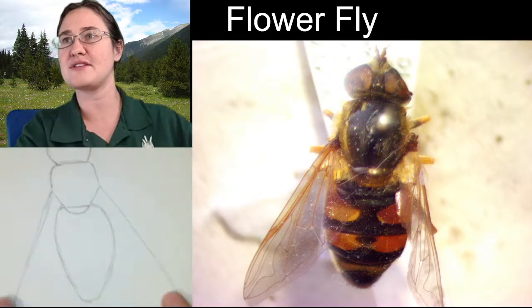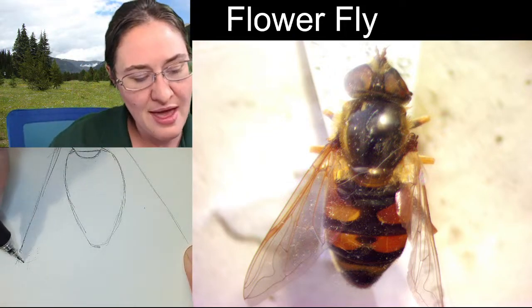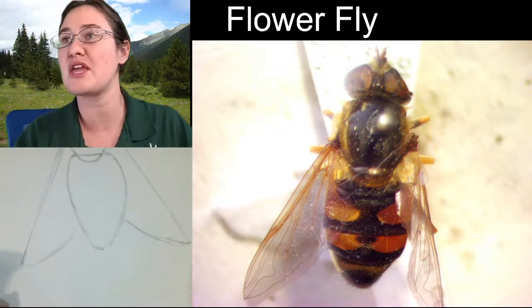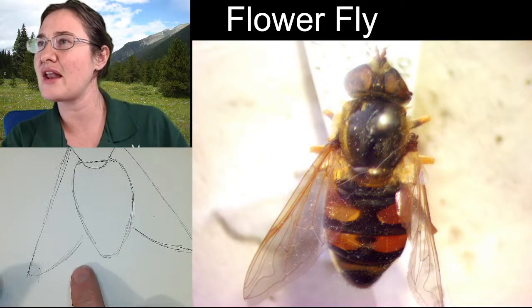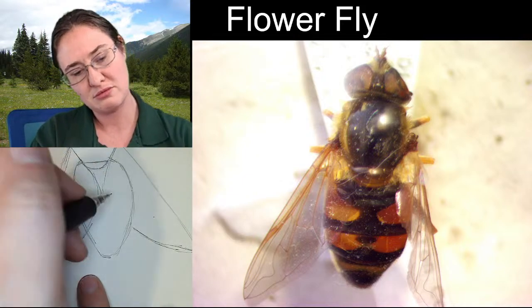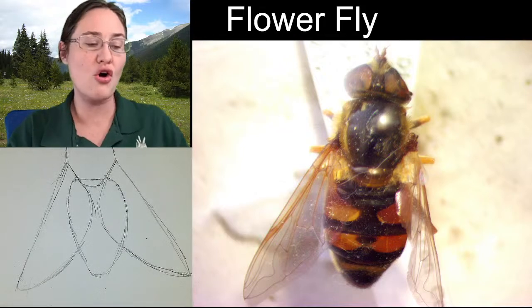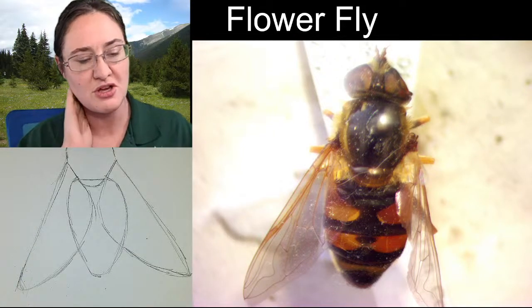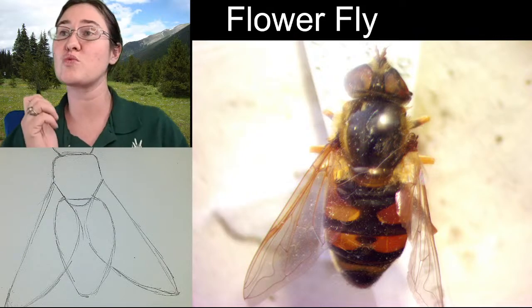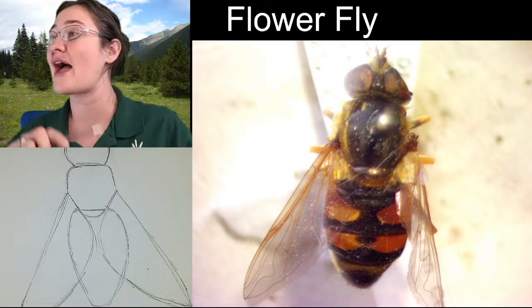So you've got these coming out on the edges, and then where they come out evenly. All right, and then they're going to angle back in towards the abdomen like this. And then I believe we're going to have to look at it a little bit, but it comes over the abdomen before coming back out. So that's going to give us an overall idea of what the wings are going to be looking like. And then when we zoom in, I get to talk to you about all the different wing veins. In fact, there's one very important vein with flower flies that helps us identify this fly all the way to family.